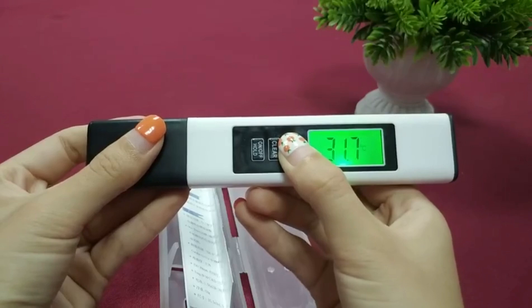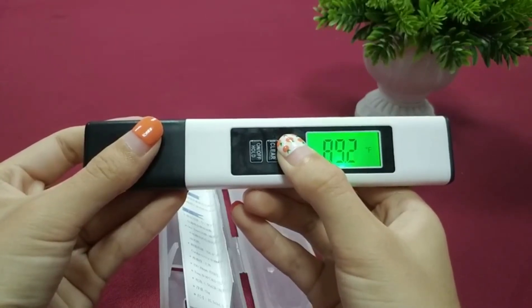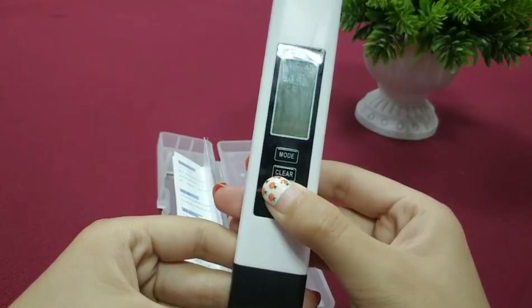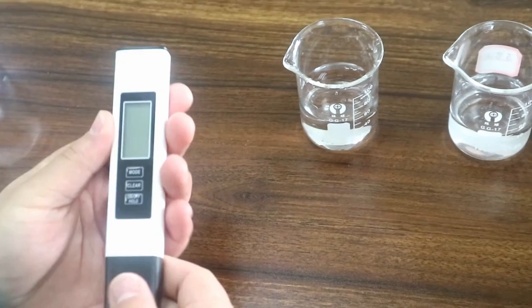The large backlit LCD is easy to read, and the auto-lock function saves your readings so you don't have to worry about losing them. Pre-calibrated and ready to use right out of the box. The auto-off feature saves battery life, and the hold button freezes your readings for convenience.